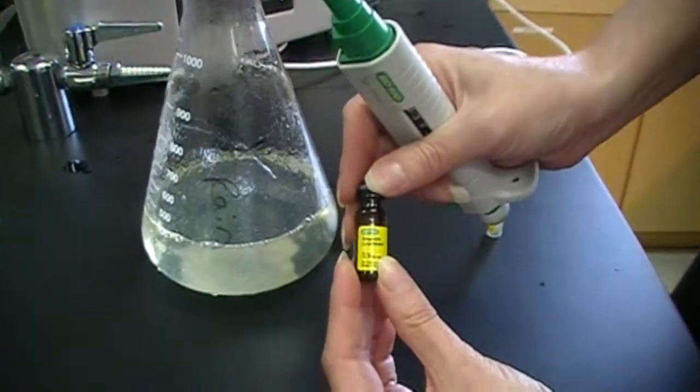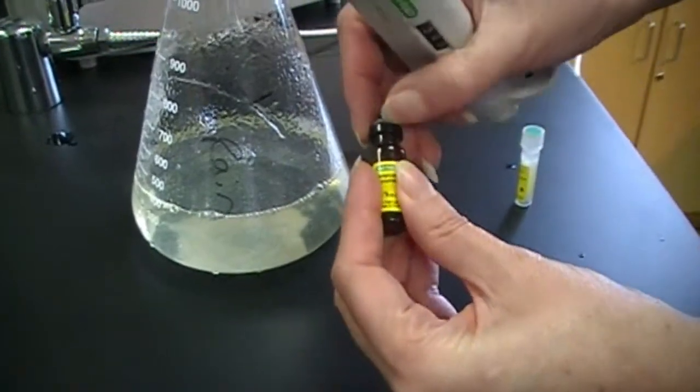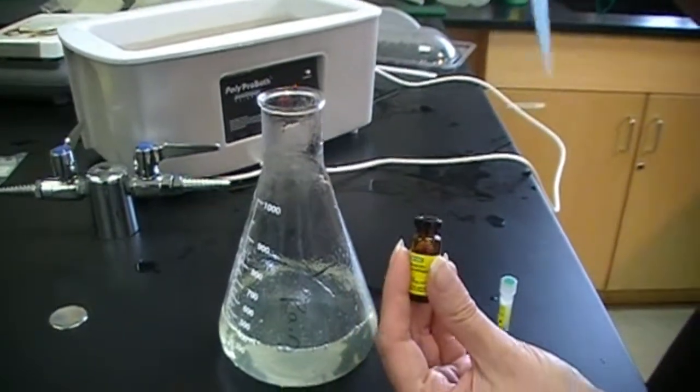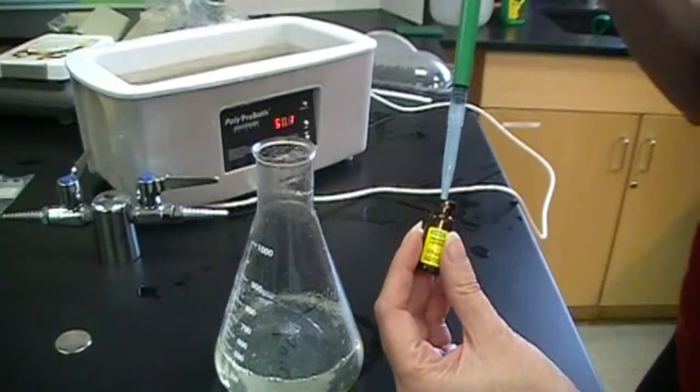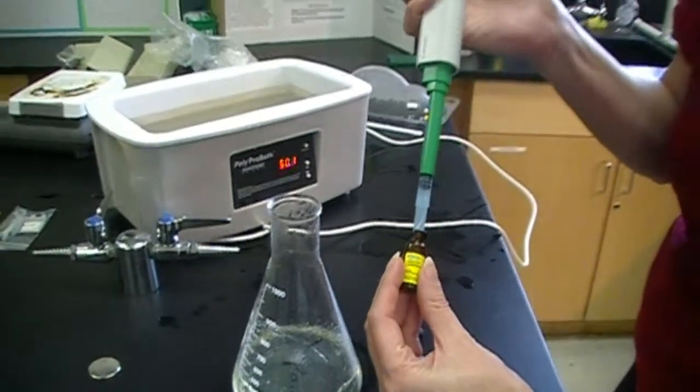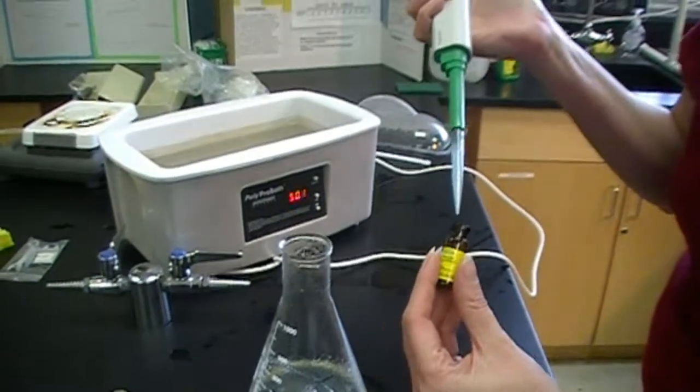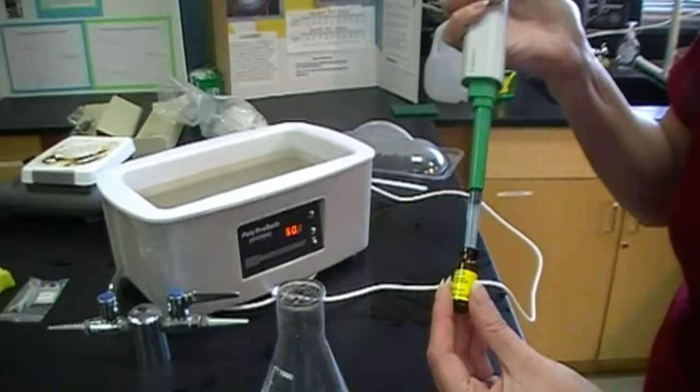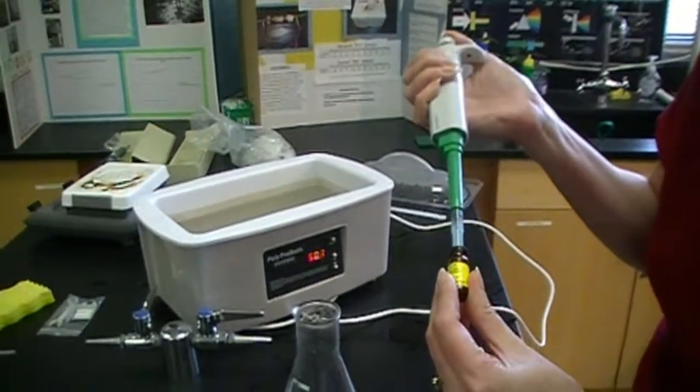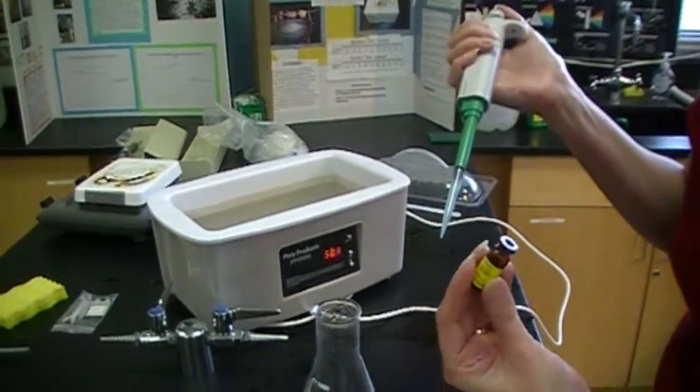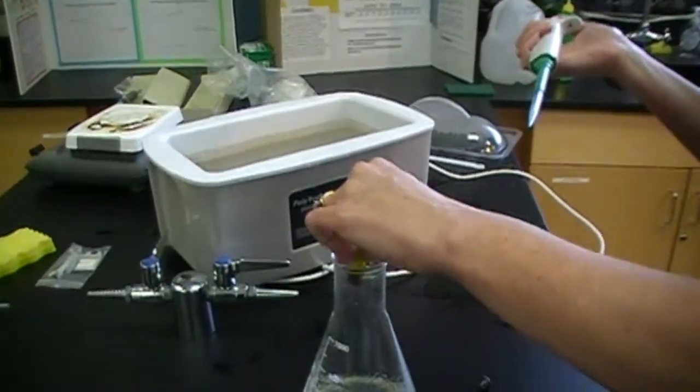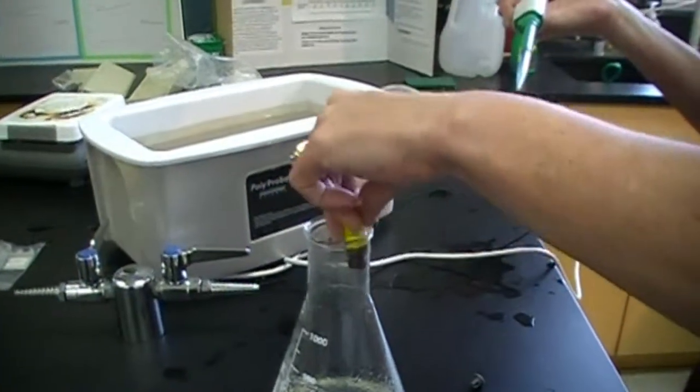This is our vial of the ampicillin, which has been reconstituted with the C. elegans wash buffer. And so right now, I'm simply going to pipette this back up. Let's try it again. Or not. We're simply going to pour it in. And let's make sure we've got every drop of that.